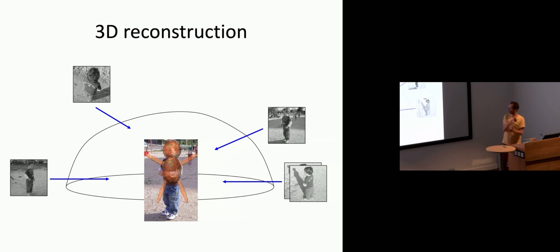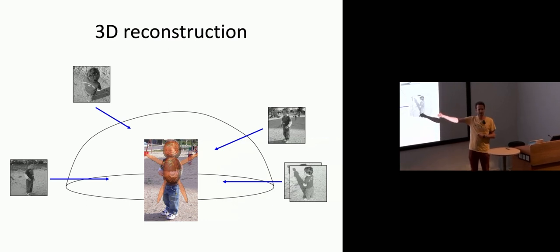Now, that will lead us to a reconstruction which is made of only images of Jan. Okay, there are no orange puppet projections in here at all. Yet, if I make this reconstruction, it will look a little bit like Jan, hopefully, but it will probably still also look a little bit like the orange puppet.